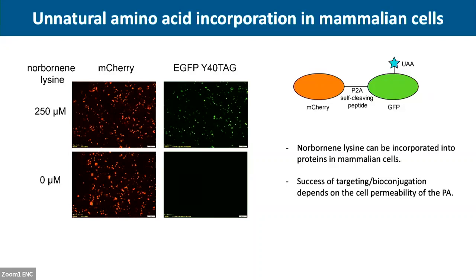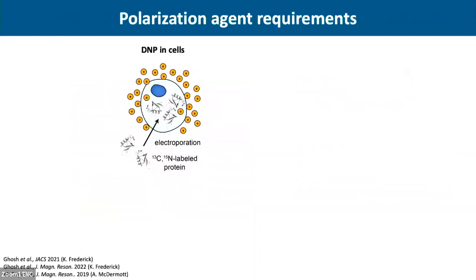We have the technology, we have the protocols to do this. Attaching the polarization agent also works reasonably well, provided that we can get it into cells. However, our issue for continuing this work much more aggressively into mammalian cells or in cells has been the polarization agents.